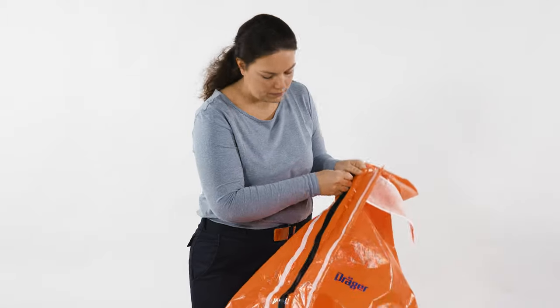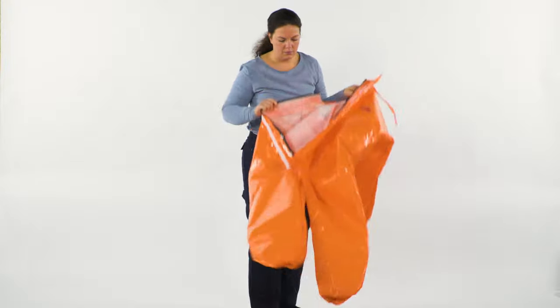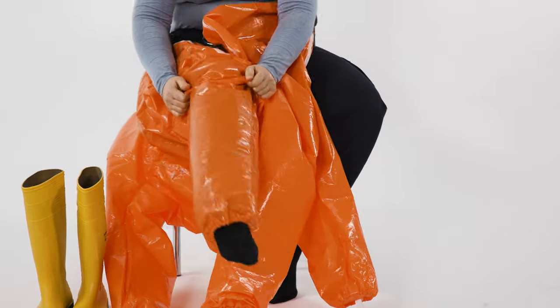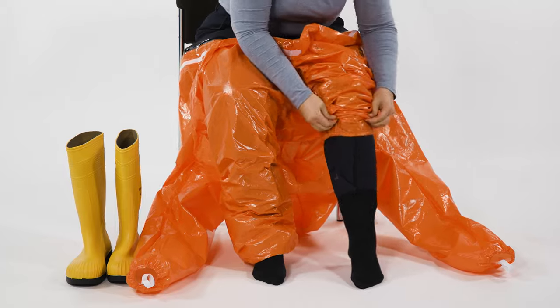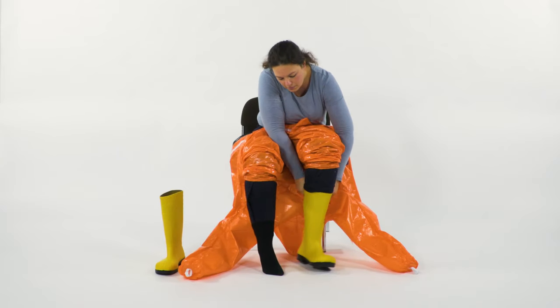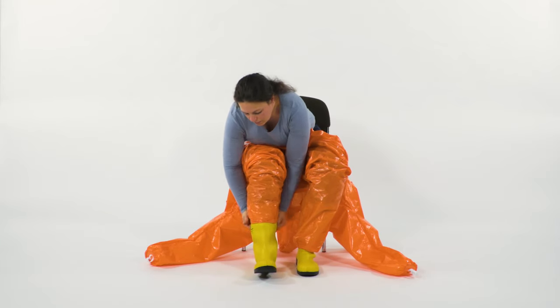Prepare the suit for entry; therefore open the zipper on the front. Step into the suit without shoes through the open zipper, first into the right and then into the left leg. Pull up the cuff and step into the boots. Then pull the cuffs down over the boots.